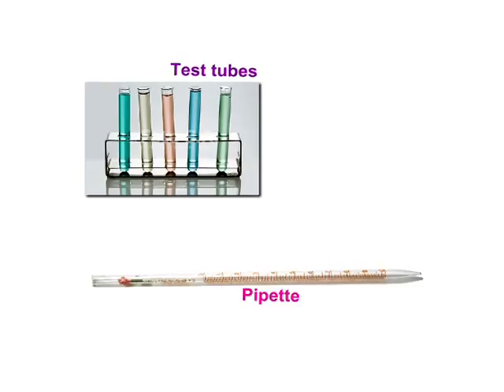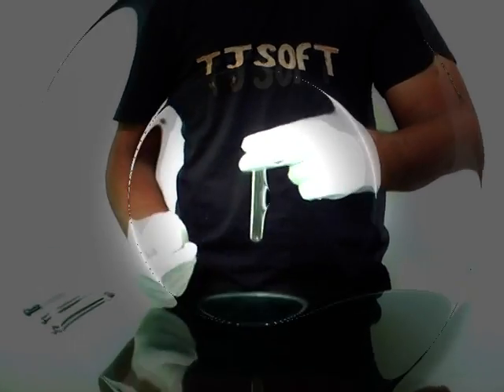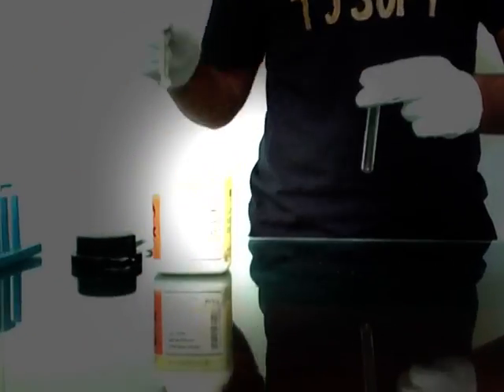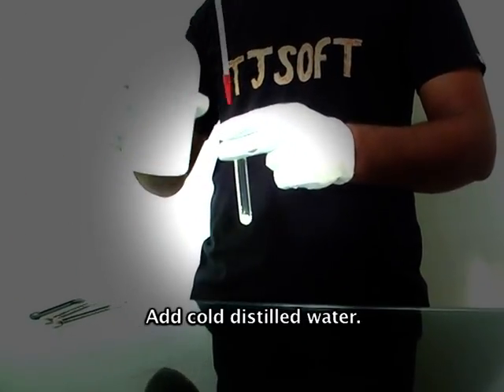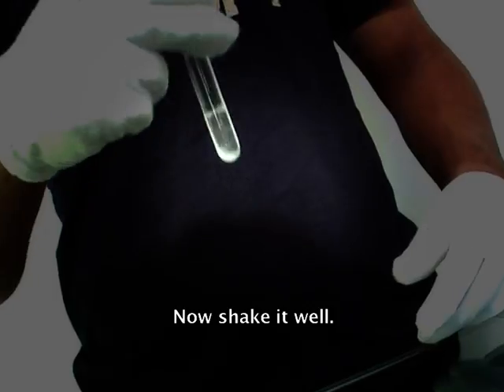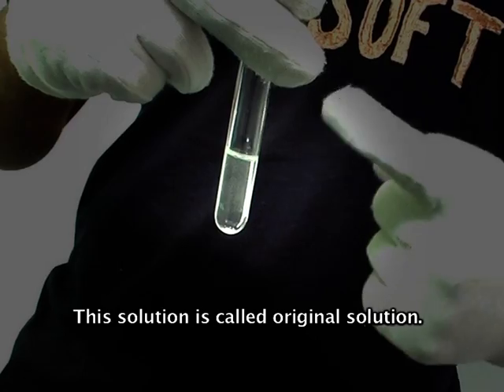Thank you so much for joining us. Take a test tube. Now add a small amount of salt with the help of a spatula and add cold distilled water. Now shake it well. This solution is called the original solution.